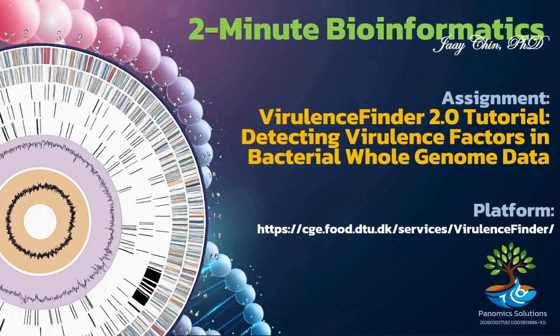Have you ever wondered how to quickly identify virulence genes from bacterial whole genome data, without getting lost in complex bioinformatics pipelines? In this video, I'll show you a fast and practical way to do it. In this quick tutorial, we'll explore how VirulenceFinder 2.0 can help you detect virulence factors in bacterial whole genome sequencing data, step by step.